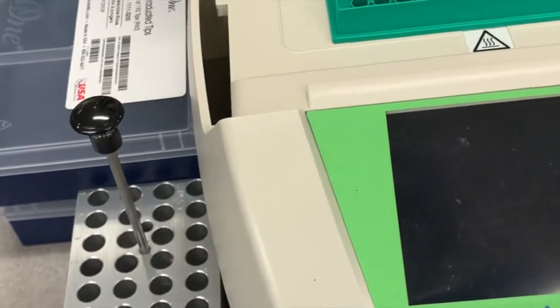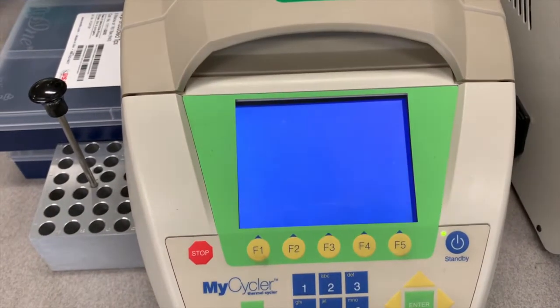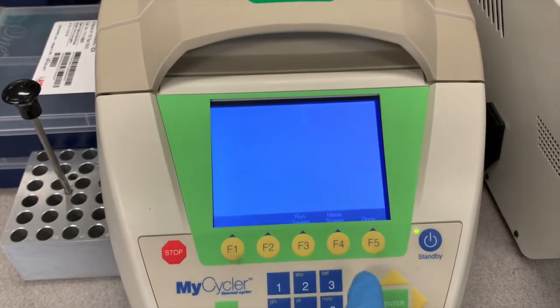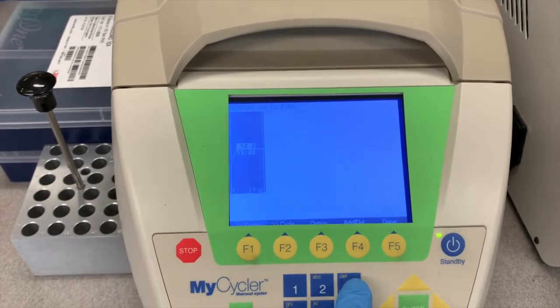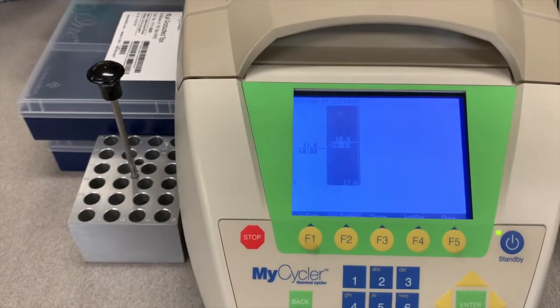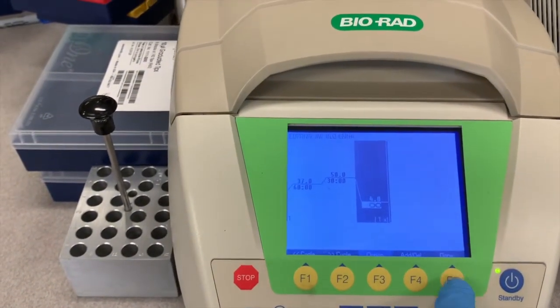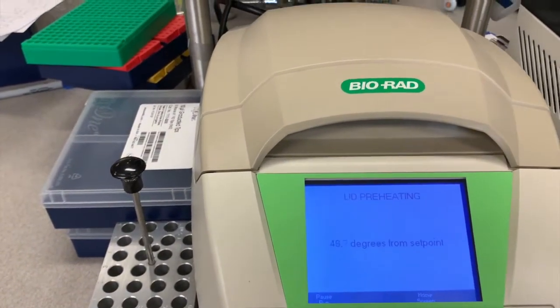Now we can take our plate over to the thermocycler, and we're going to use this to heat up our reaction and make sure it stays constant during the reaction. When we load it in, we're going to start up the thermocycler and create a custom protocol. We'll edit an existing protocol and add a step at 37C for 60 minutes because we just want to see products for this reaction. Then our quench is going to be at 50C for about 30 minutes. And then we put a final step of 4C so that it can hold there and stay stable afterwards.